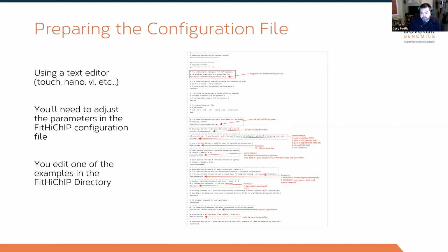So next with HiChIP, there's a few model parameters that you could build in. There's S, which is more stringent and really useful for peak-to-peak calling. It really gives you a nice tight model there. And so anything that's greater than that, the p-value there is quite strong. Things that are more noisy, like enhancers, promoters, transcription factors, you want to use the looser, less stringent thresholds. This is kind of because there is so much more data to consider that you want to really relax some of the statistical thresholds when you're assigning that p-value. It doesn't devalue that p-value, it just is more in line with the biological question that you're asking there.